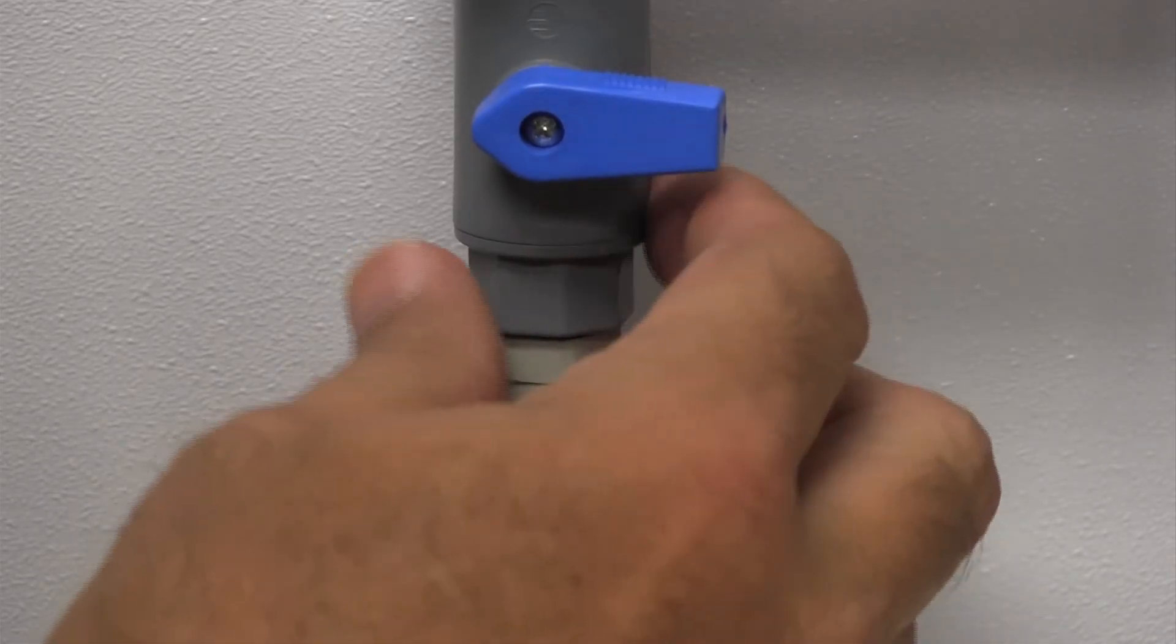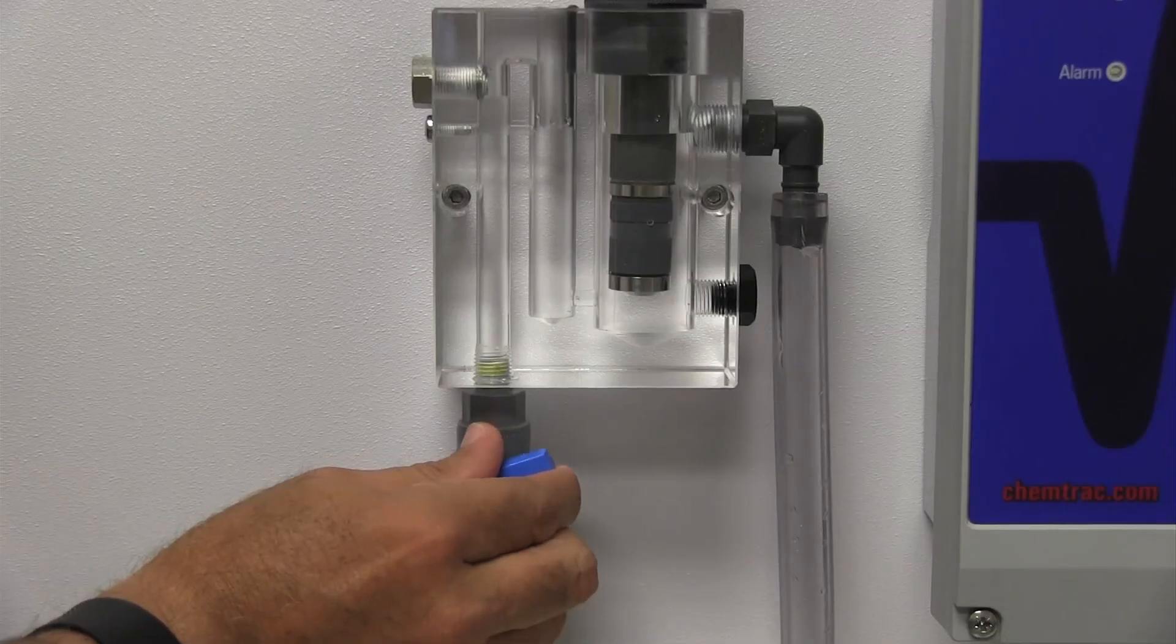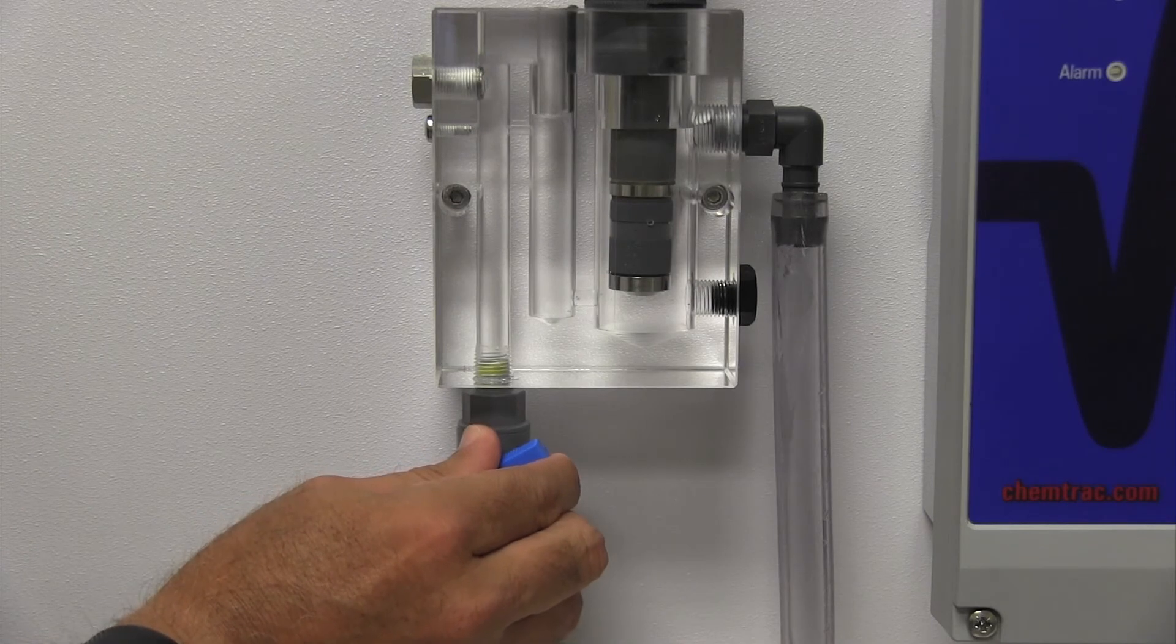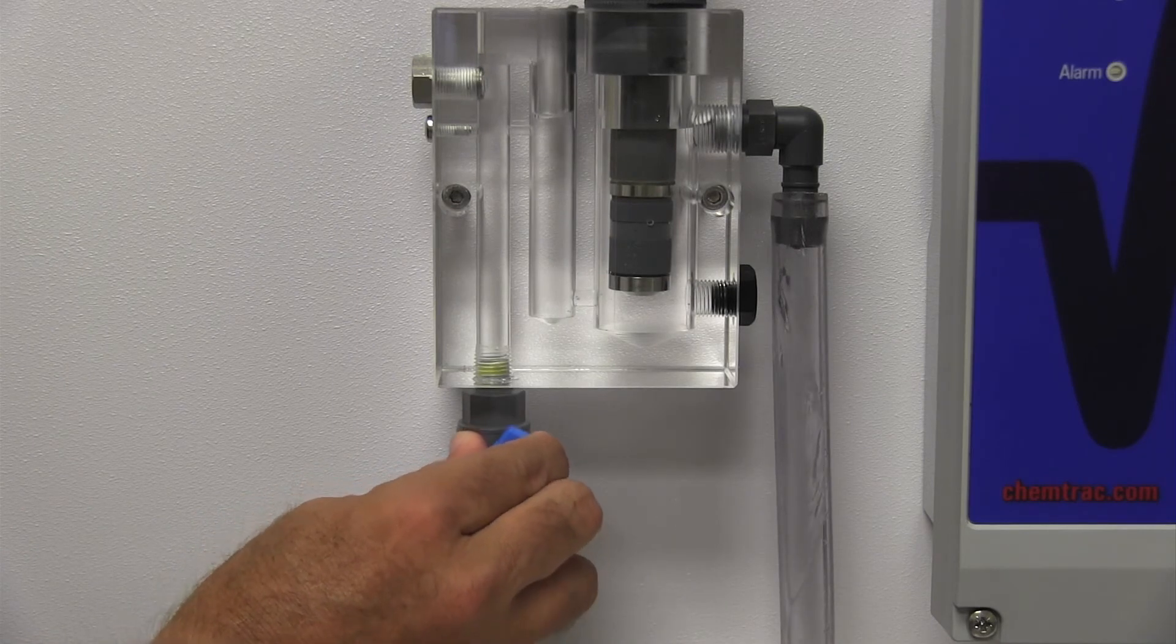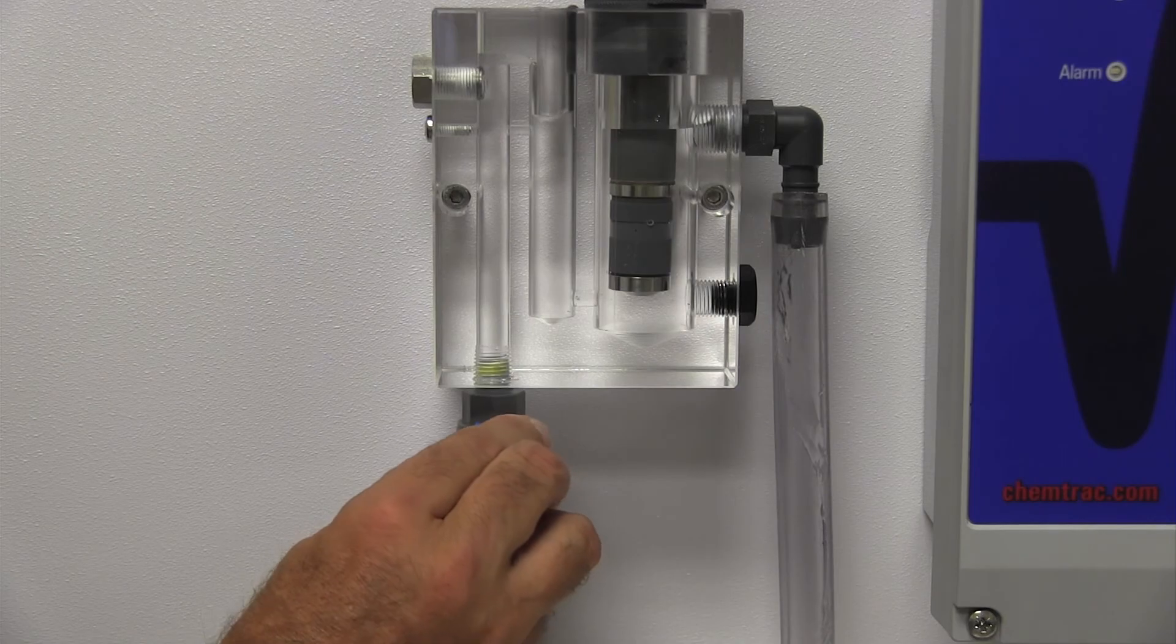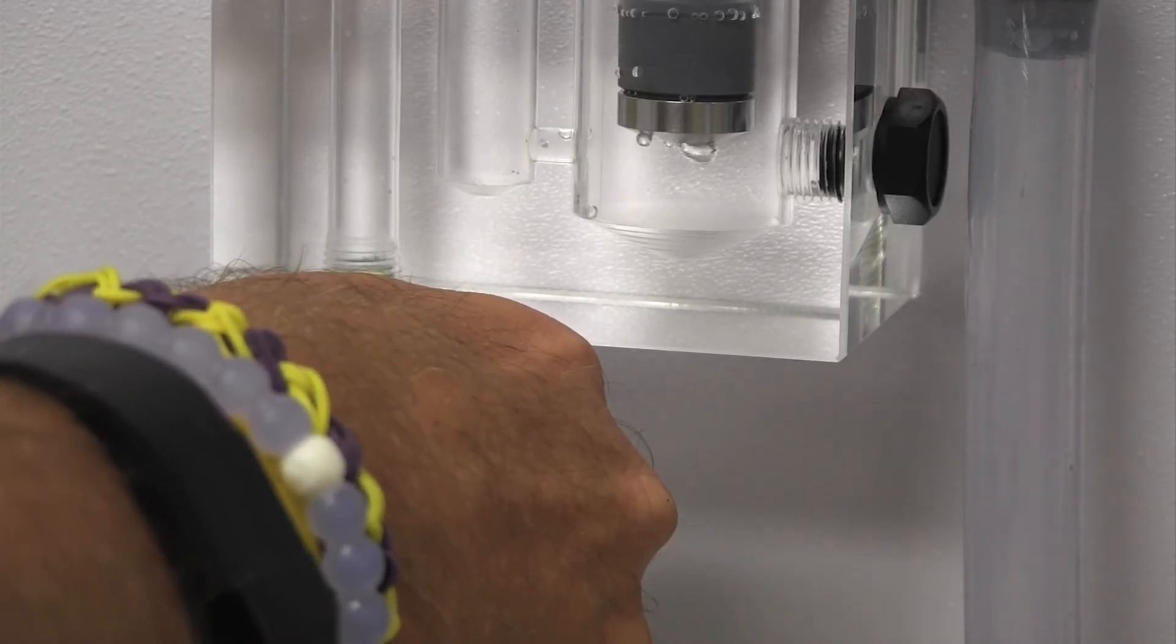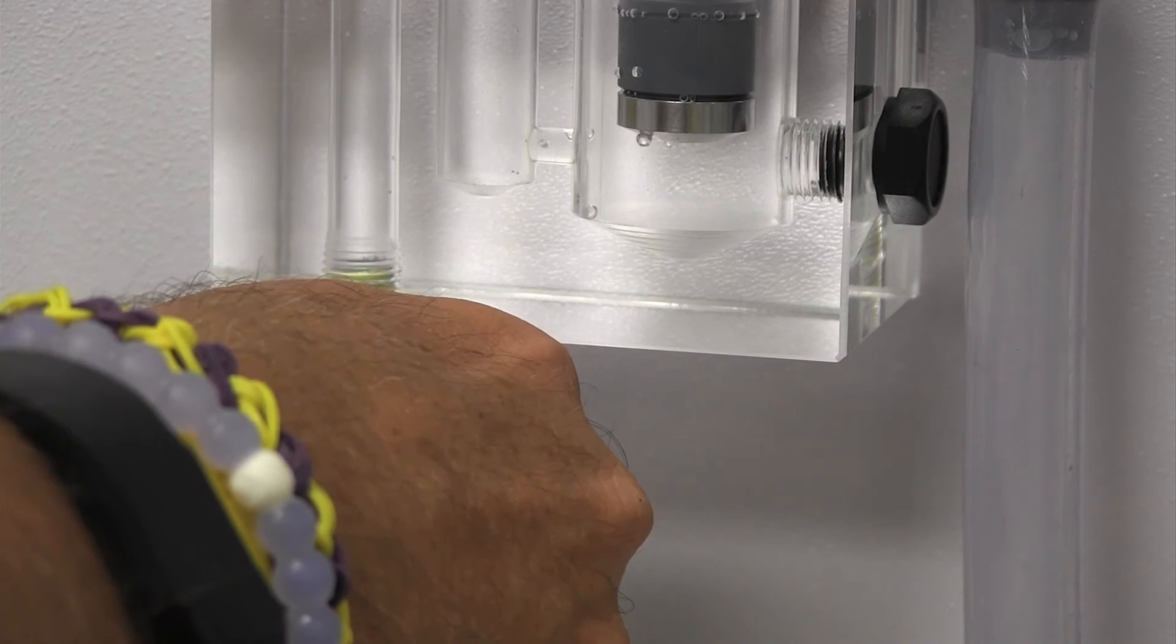Connect the sample tubing to the inlet fitting on the flow cell and start the flow of water. The recommended minimum flow rate is 500 milliliters per minute, but higher flow rates of 700 to 900 milliliters per minute may be needed to keep the membrane free of bubbles.